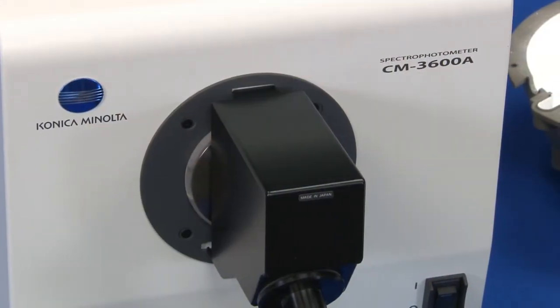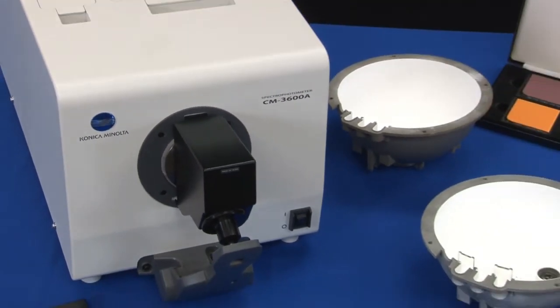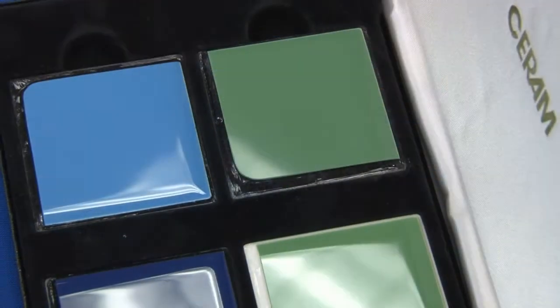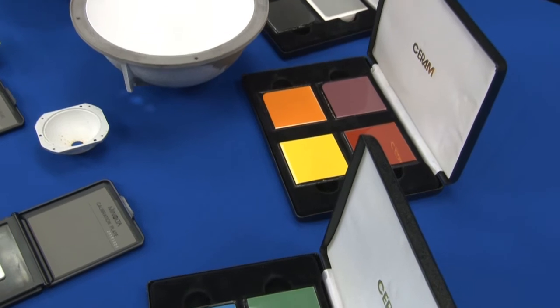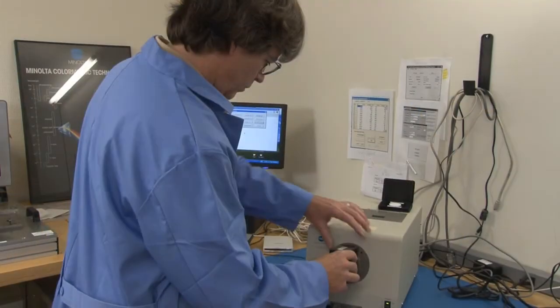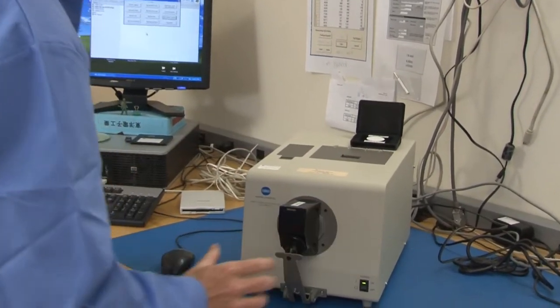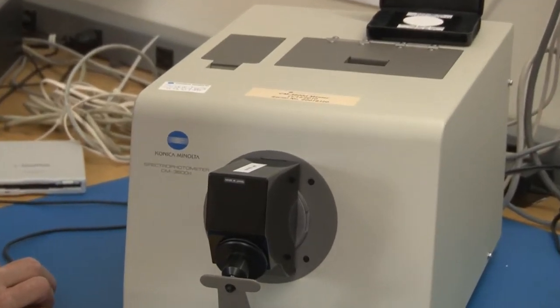To demonstrate the value of annual calibration, we will be using the CM3600A spectrophotometer as our sample instrument. As part of our inspection process, 14 color standards certified by Konica Minolta and traceable to national standards are used to determine the performance of the instrument. Before service is performed in our state-of-the-art laboratory in Ramsey, New Jersey, an evaluation of the instrument and its condition is completed by a trained service engineer.